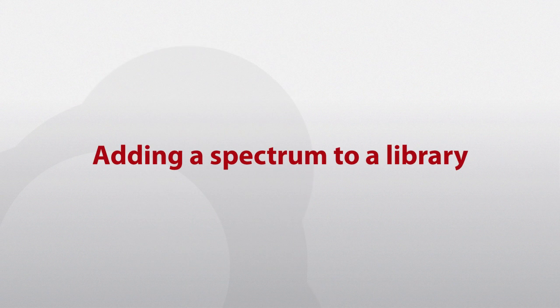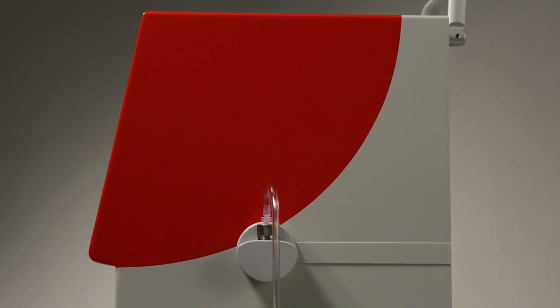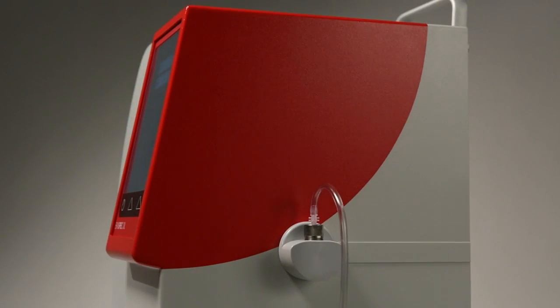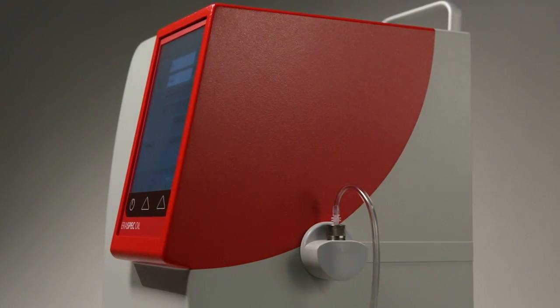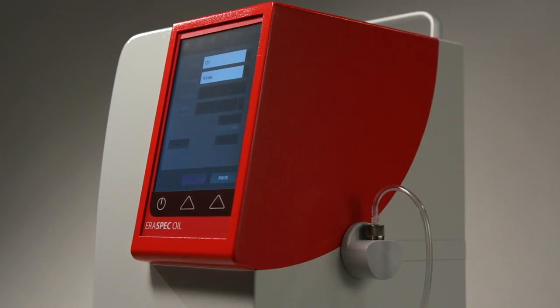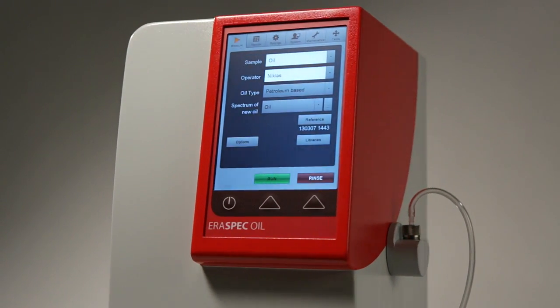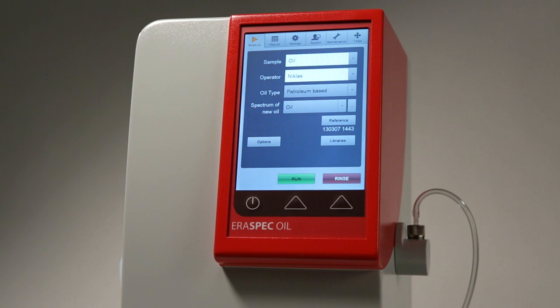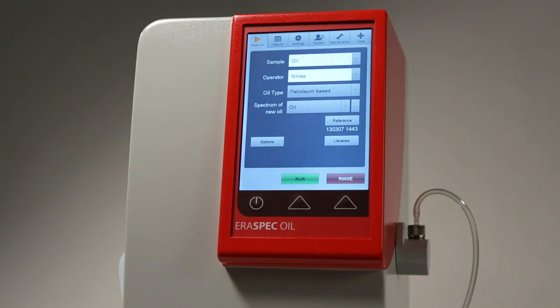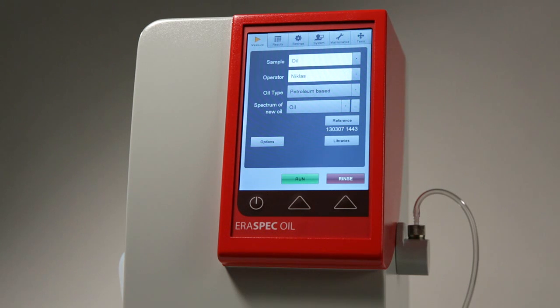Adding a spectrum to a library: ERASPEC OIL uses a library or database to calculate results for complex parameters such as viscosity, viscosity index, TAN, and TBN. These libraries store typical samples together with the known values of these parameters as determined by the respective reference methods.